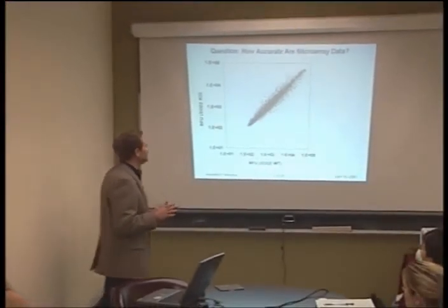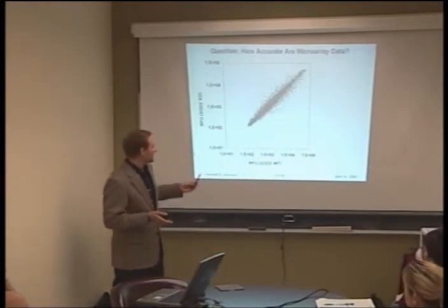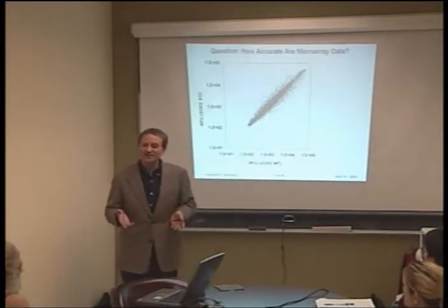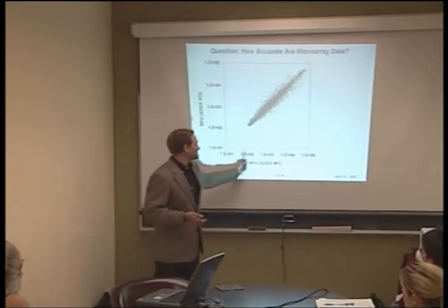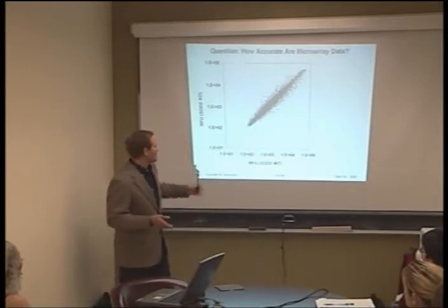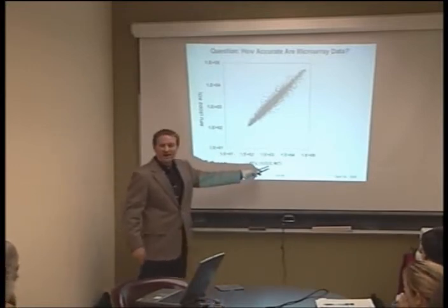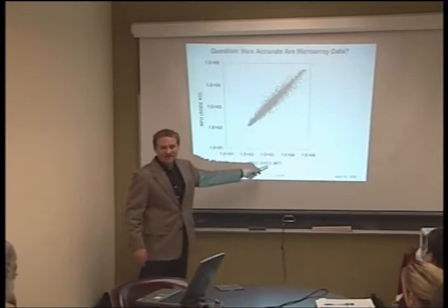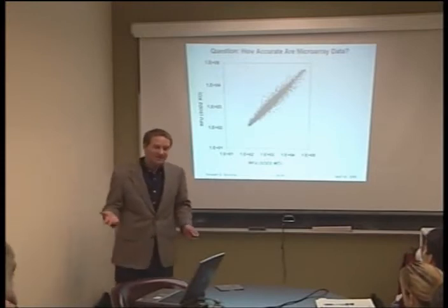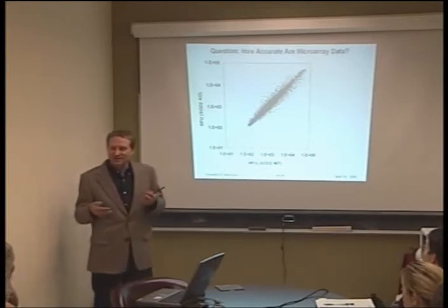I'm just going to show you this figure. This is the type of data output you get from a traditional microarray experiment. This is a log 10 scale of abundance of a transcript. In other words, you're talking about a span of 4 orders of magnitude of mRNA concentration from one sample and from another sample. In this particular experiment, it was a knockout mouse that's missing a key antioxidant enzyme. Sorry, this is the wild type, and a knockout. And these animals have got a very dramatic phenotype. They die actually about a week after birth.